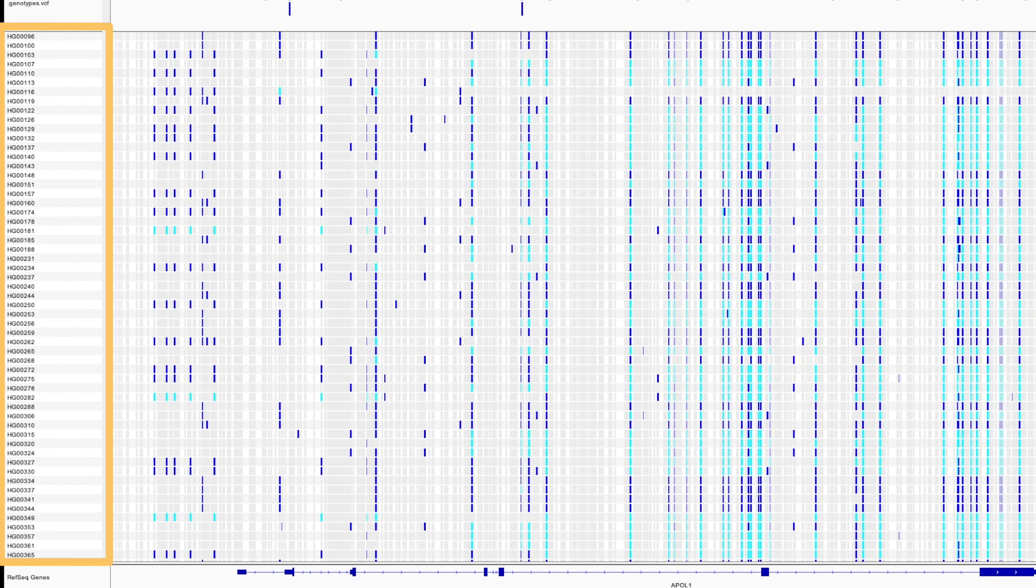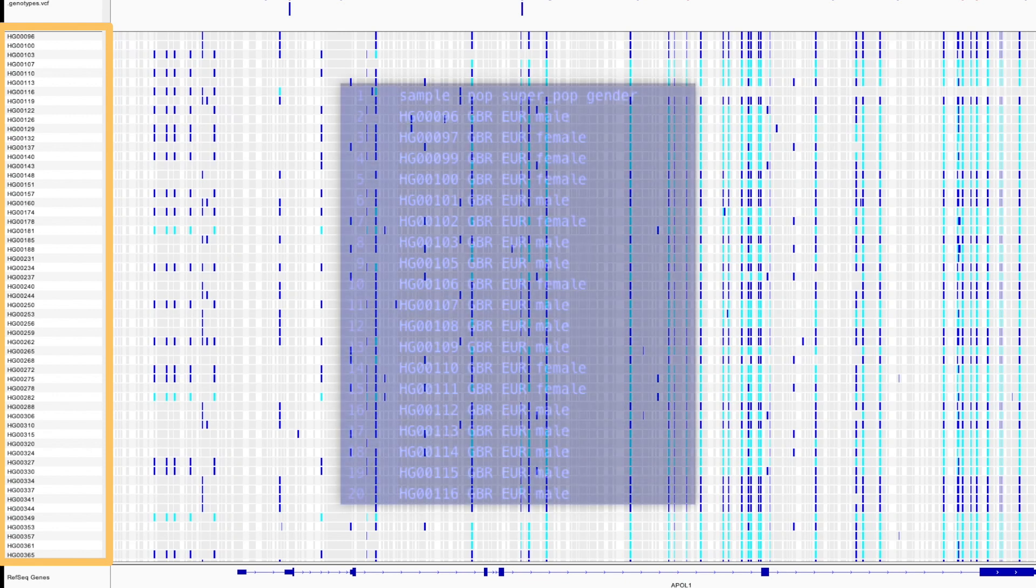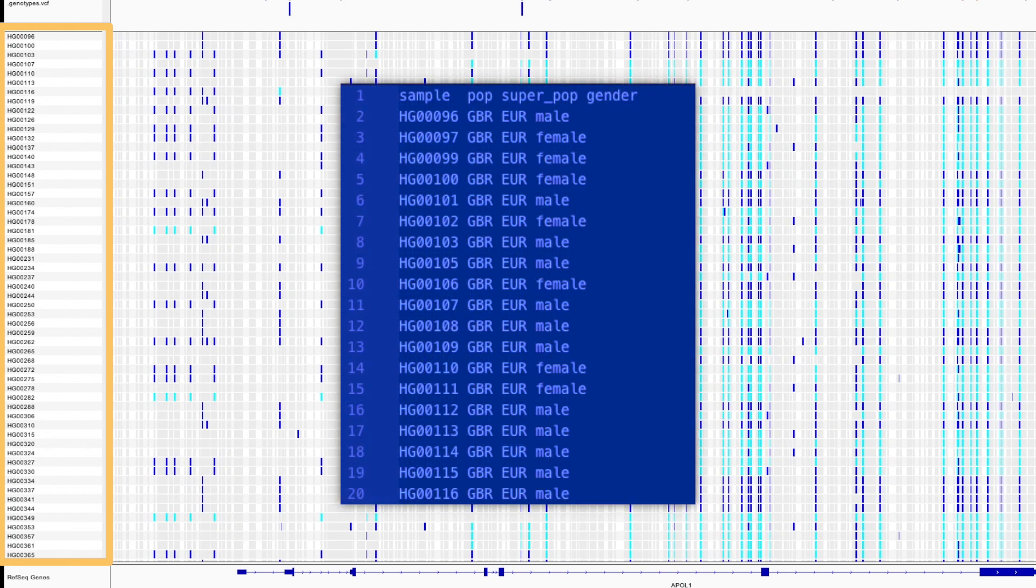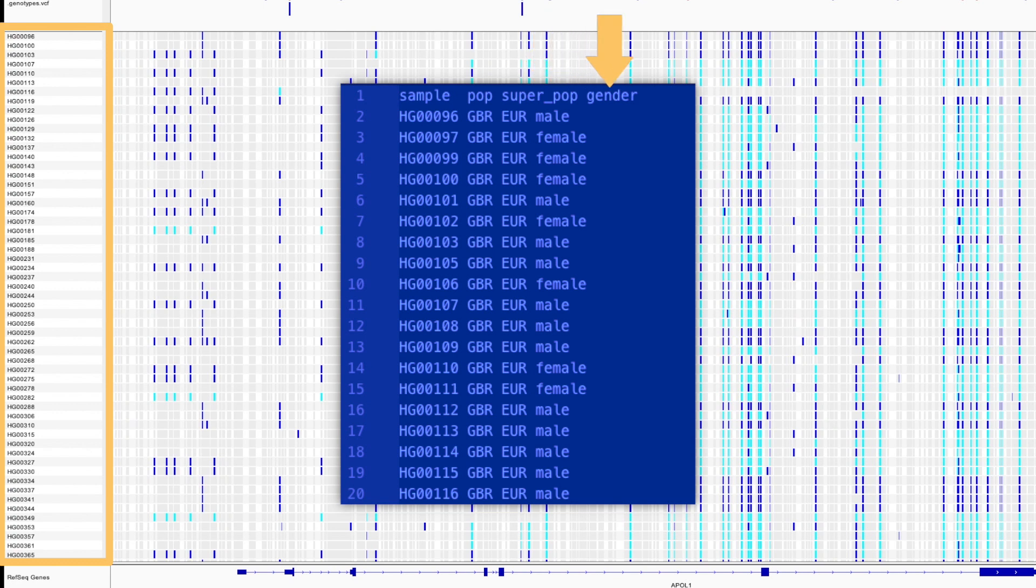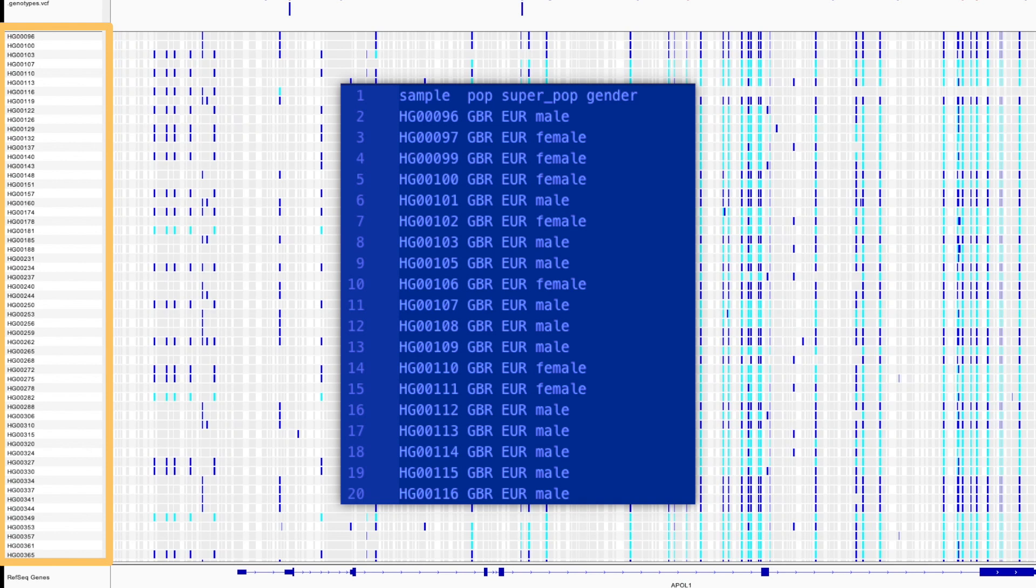Now as I mentioned before, these samples are from people all over the world. To tell us what sample is from where, I have a file which lists the population, superpopulation and gender of each sample. To find population-based patterns, I'm going to need to get this information into IGV. But how am I going to do that?